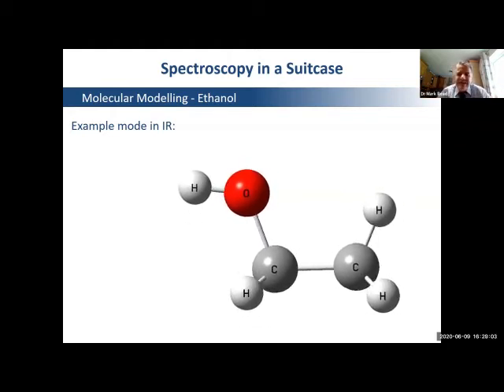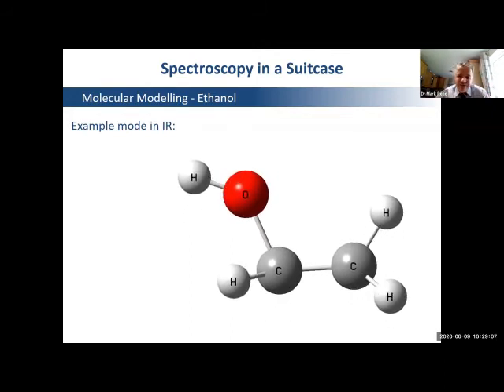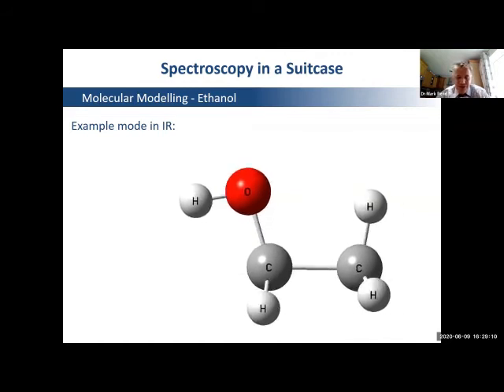The only difference is that when we place the crystals on the sample stage, we have to compact them down so they have better coverage. I'm going to show you that shortly.